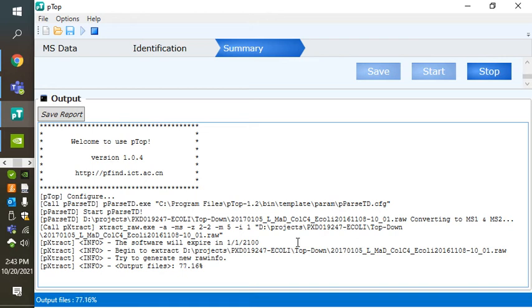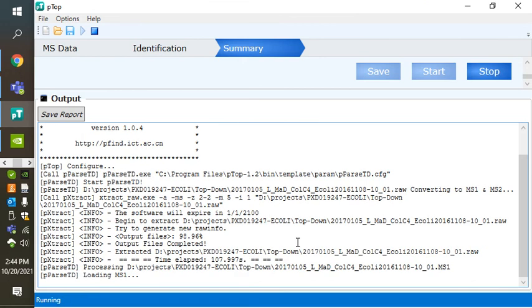I actually found that email address was not being monitored, so I sent it to my friend Chi Hao at the Institute for Computing Technologies. When I received my license in response, the license is a document I have to then import into the software, and after that, it just is happy as a clam to do anything you want.